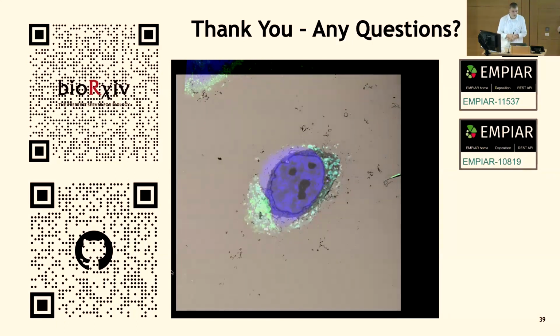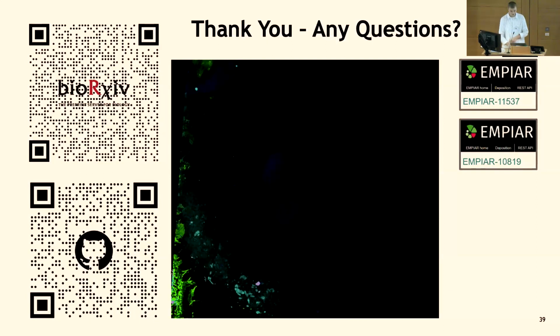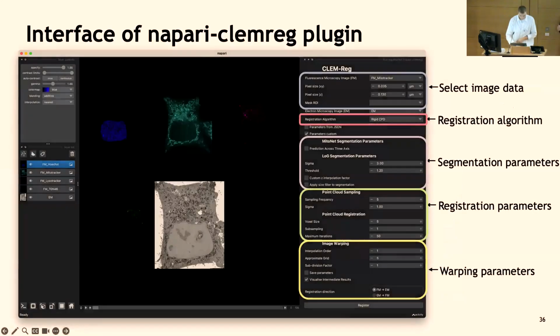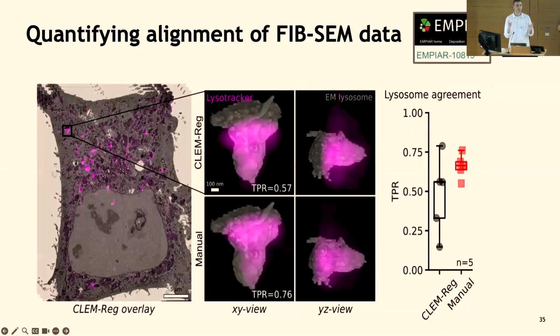Yeah, so I think we found that in general, the alignment is better where the mitochondria are abundant. Hold on, I'll go back to one of the slides. Some of the lysosomes, for example, were in regions where there weren't many mitochondria available, and we'd expect that the registration process is best around regions of dense mitochondria, whereas because we've selected lysosomes that are not necessarily within this big cloud of mitochondria, the registration isn't going to be as good in that one area.